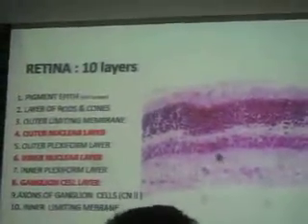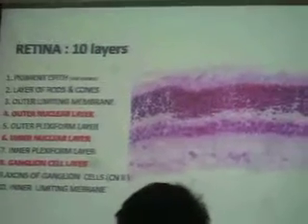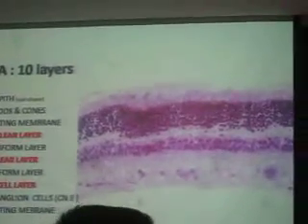The slide labeled as the retina will not have the pigment epithelium. So you have to appreciate the 10 layers in the previous slide, where you had the 3 coats. Okay?